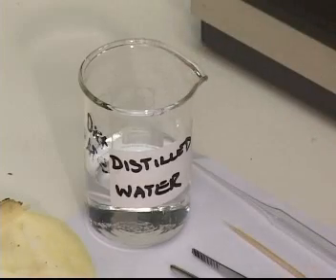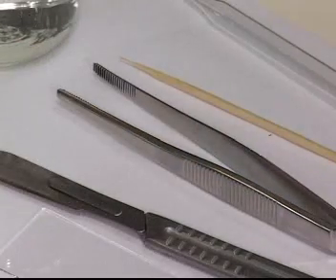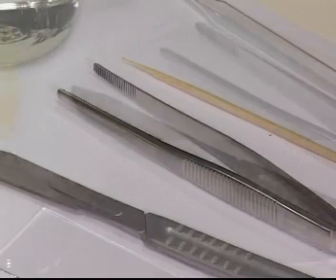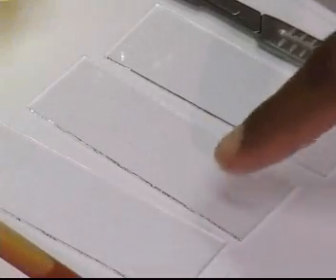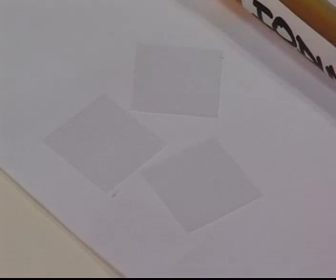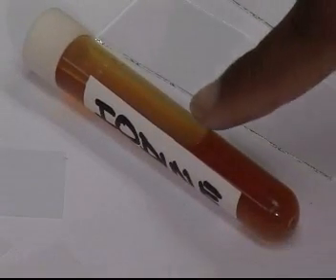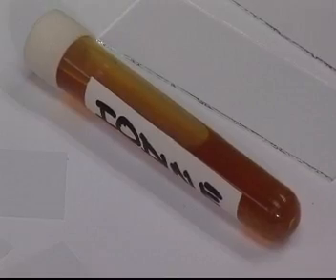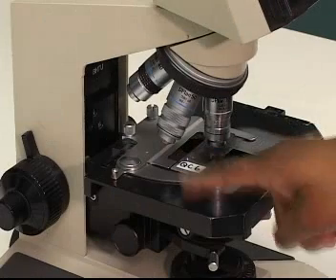You will need the following materials or apparatus to make the slide: a small beaker with water, a dissecting needle, a pair of forceps which we use to pick up small objects, a scalpel which is used to cut our specimen, slides on which we place the specimen or object to be studied, cover slips which are these tiny pieces of glass that we place over the specimen, iodine solution, droppers, onion bulb, and a microscope.